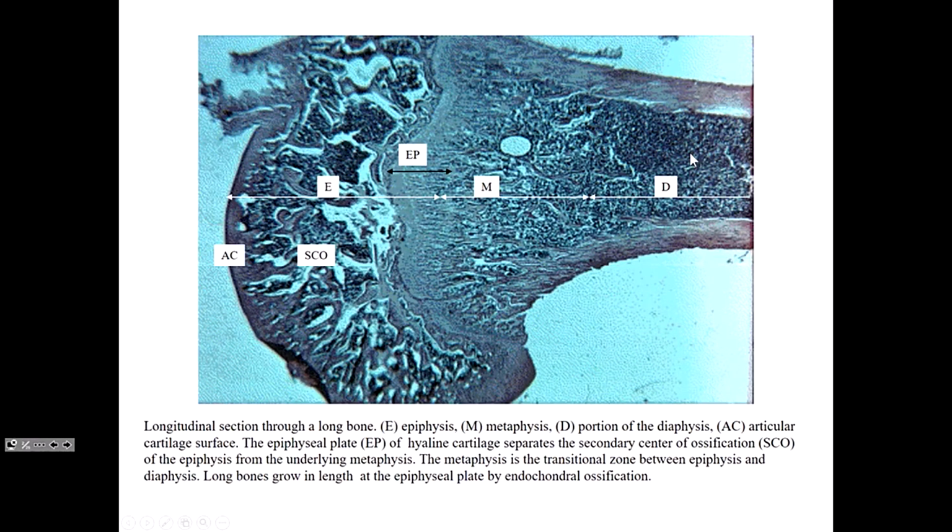Yes? So we're looking at a teenager? Yes, probably, because you can see an epiphyseal growth plate. Yes. Other questions?